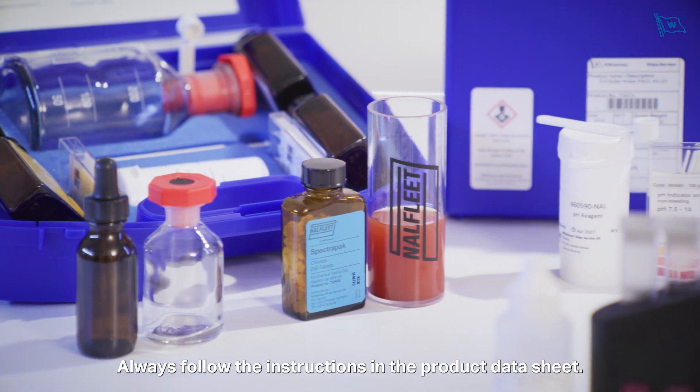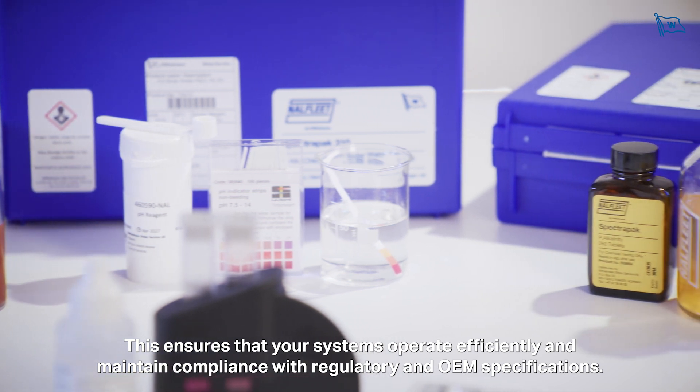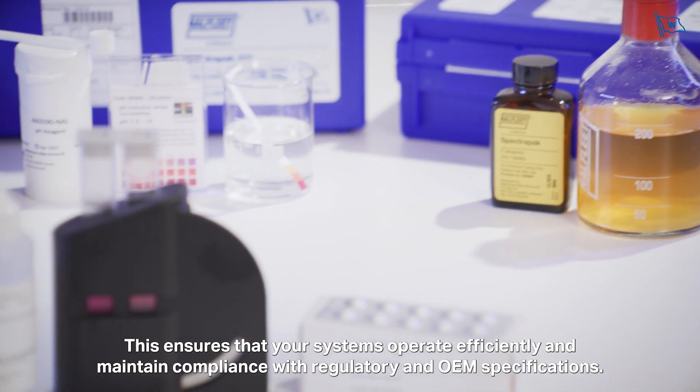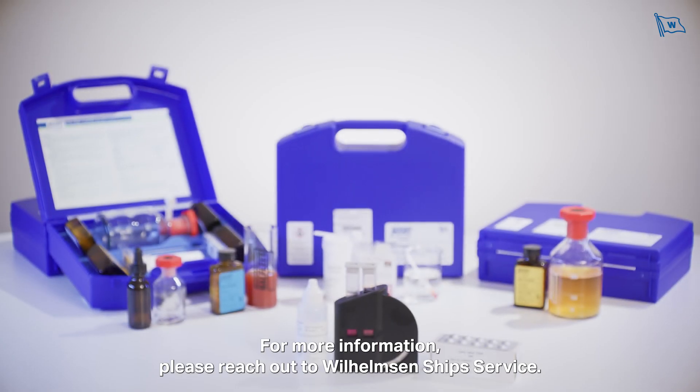Always follow the instructions on the product data sheet. This ensures that your systems operate efficiently and maintain compliance with regulatory and OEM specifications. For more information, please reach out to Wilhelmsen Ships Service.